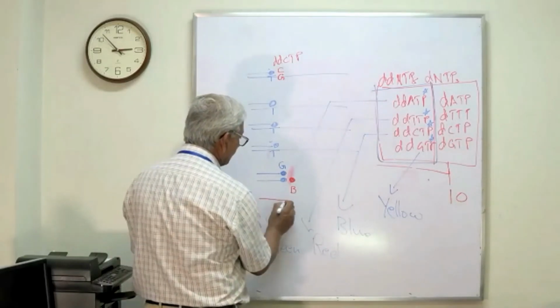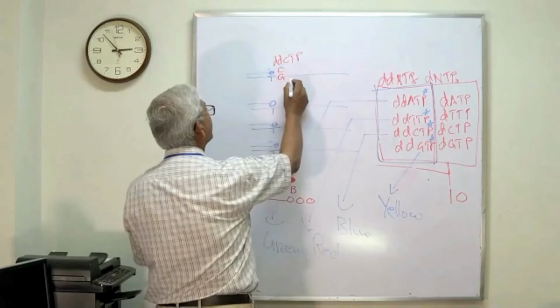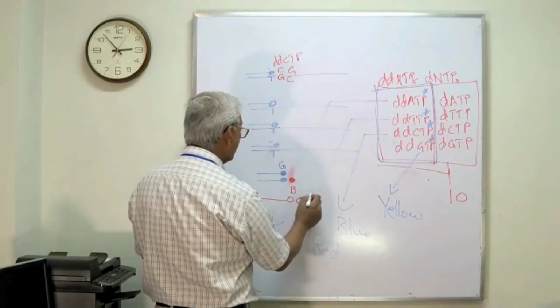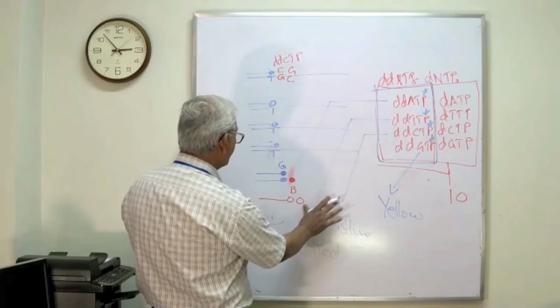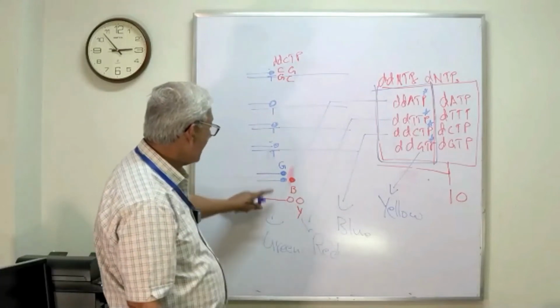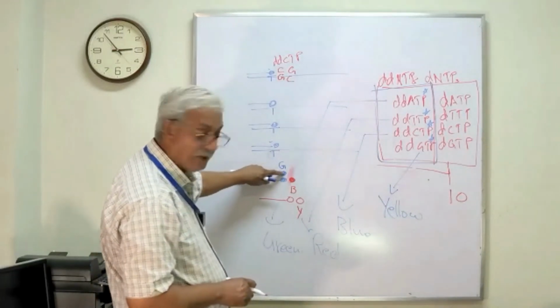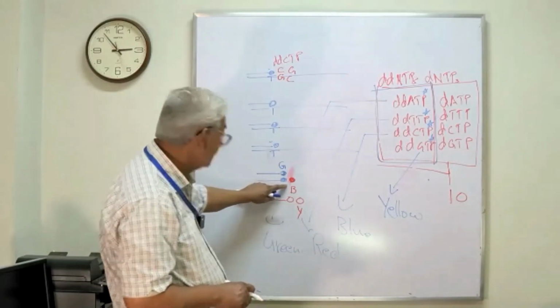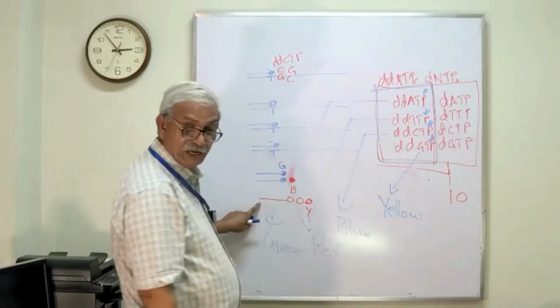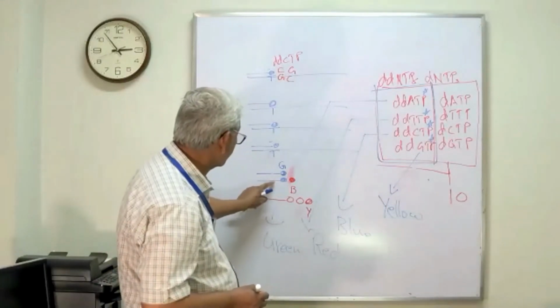If the chain elongation proceeds 1, 2, 3, and suppose this third one is C is here, G is here. The third one is addition of G, which is yellow in color. So this is yellow. So you are getting nested sets of DNA fragments. What does it mean? It means primer plus 1 nucleotide, primer plus 2 nucleotide, primer plus 3 nucleotide. And this is now a yellow fragment. These are nested sets of DNA fragments which differ from each other by 1 nucleotide.